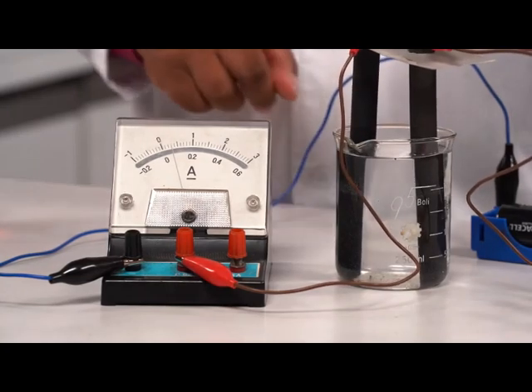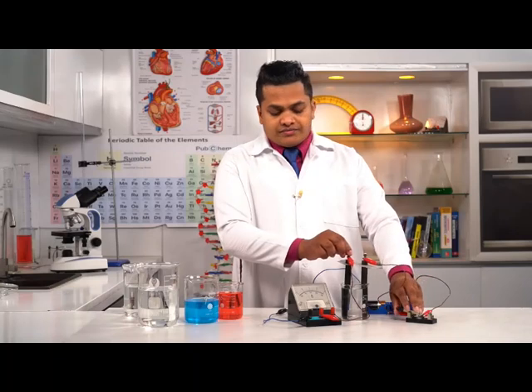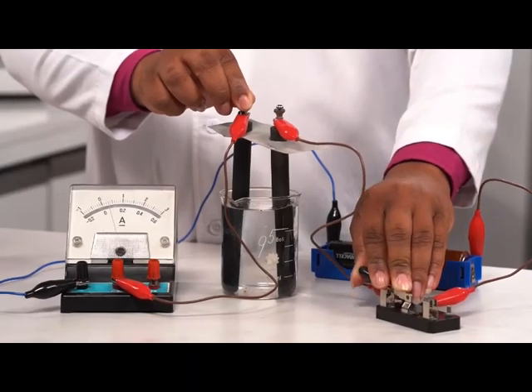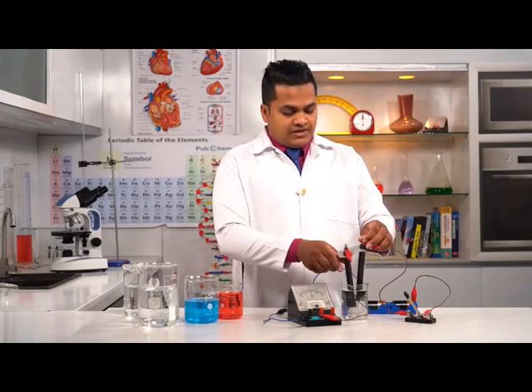That means, my dear children, this salt solution conducts electricity. See? Right. So salt solution can conduct electricity. Acidified water can conduct electricity. The two solutions.